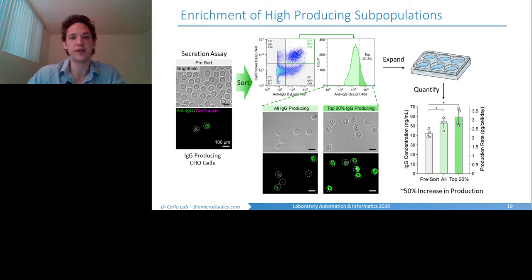And you'll notice in this top section of the graph that there's actually a sizable population of cells that are not producing antibody, so no longer secreting these molecules. We noticed this earlier when we were doing microscopy analysis, and we did some further analysis to verify that this is not due to viability or things like that, but there's actually a subpopulation within our clonal cell line that is not effectively secreting the molecules of interest.